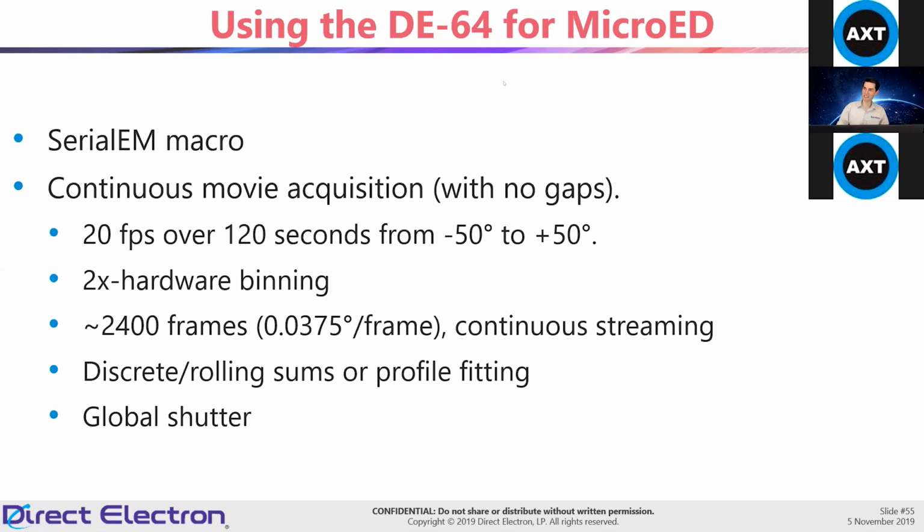The beam intensity, obviously, for micro-ED is very different than any of the other diffraction techniques for the electron microscope. But yes, there is a certain risk of damage should the unscattered beam move away from the beam stop. But it's risk versus reward. Most of the time, if there's an accidental exposure in diffraction mode, the damage is not permanent. And typically we'll work fairly closely with our customers that are trying micro-ED.